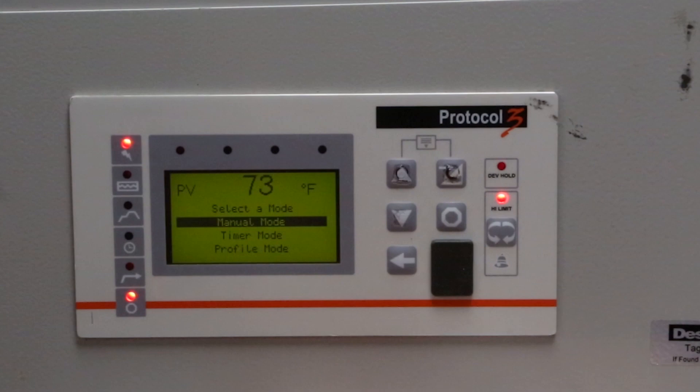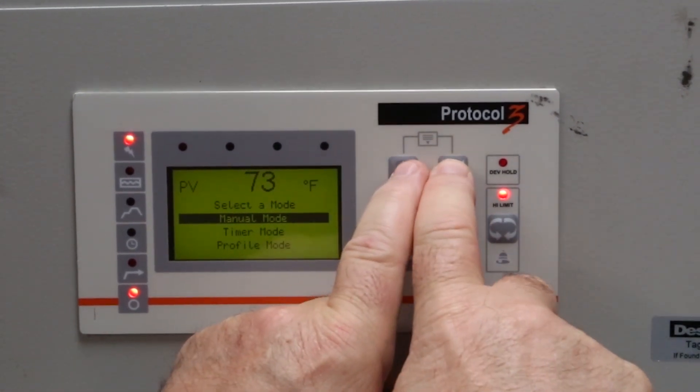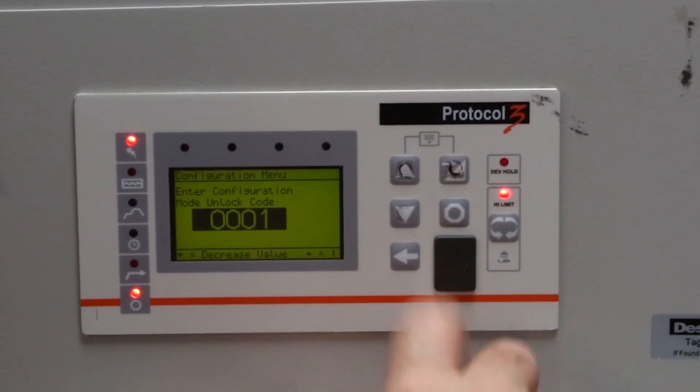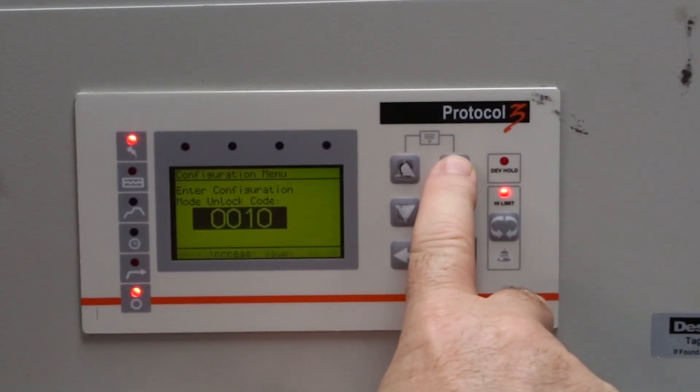Use the same process to change the engineering units on the high limit. Press the up arrow and the enter key at the same time. Push the down arrow to highlight the configuration menu, then press enter. Set the unlock code to 10 using the arrow keys, and press enter.